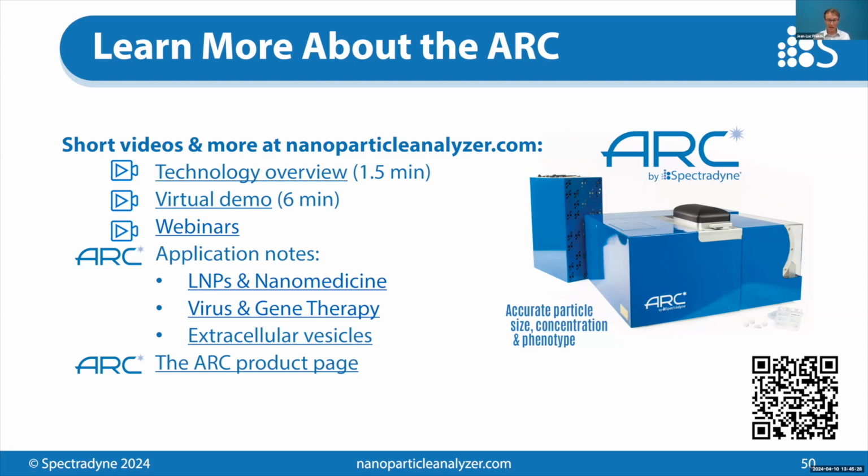The LNPs are stable as evidenced by our replicate measurements, as well as that volume dependence of brightness that I presented earlier, which shows that the particles are intact during the measurement. We're getting a nice scaling of brightness to particle size. And that shows that we're indeed staining the internal payload of the particles, and that they're intact also. So hopefully that answers your question.